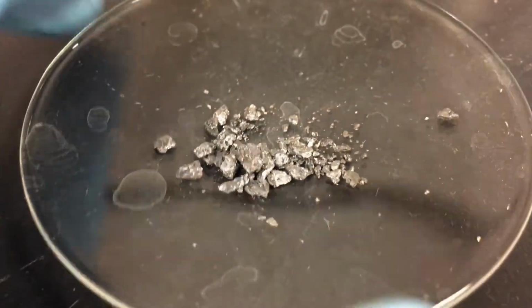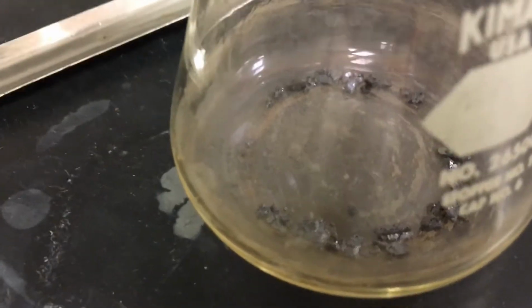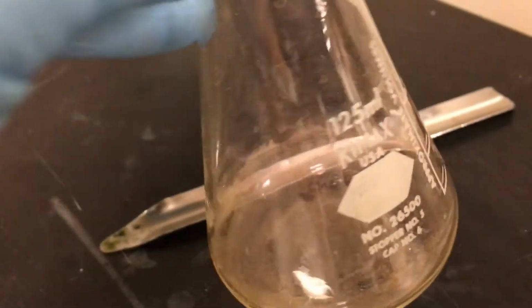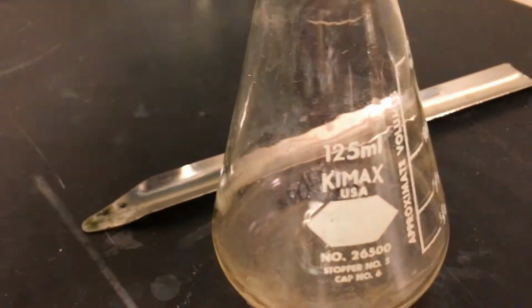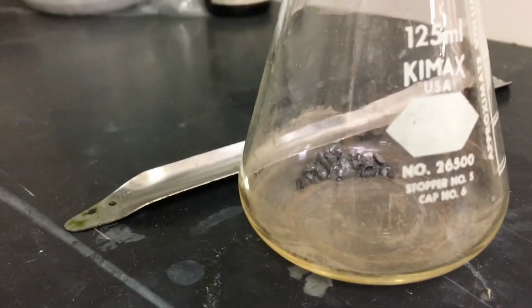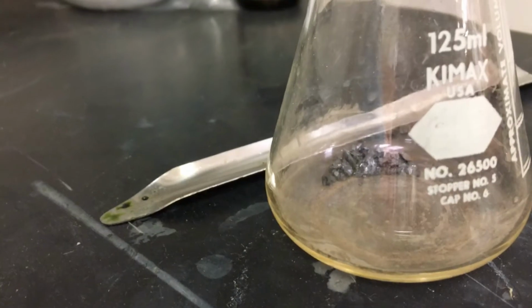Now, kind of like bromine, we can tell this is held together pretty loosely. Inside this flask here, I've got a little bit down at the bottom. You can see this kind of purple haziness inside this flask here. If I tilt it around, maybe you can see a little bit better. That hazy purple is actually the gaseous form of iodine. So it can sublimate. It goes straight from a solid to a gas. And again, that has to do with how those molecules are held together.